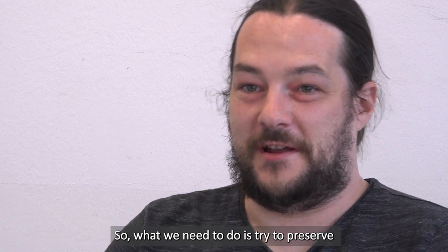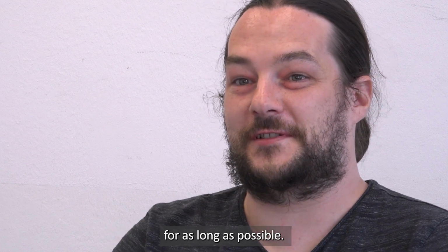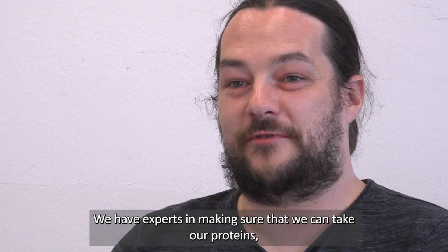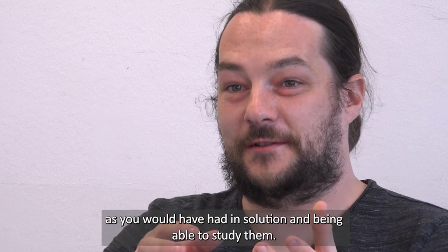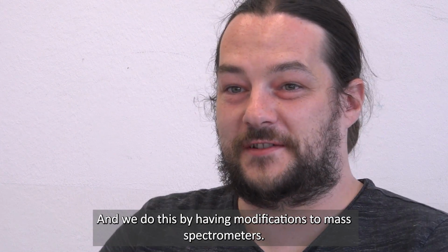So what we need to do is try to preserve as much of their surroundings as possible for as long as possible. We are experts in making sure that we can take our proteins, keep them looking in the same shape, having the same molecules bound to them as you would have had in solution, and being able to study them. And we do this by making modifications to mass spectrometers.